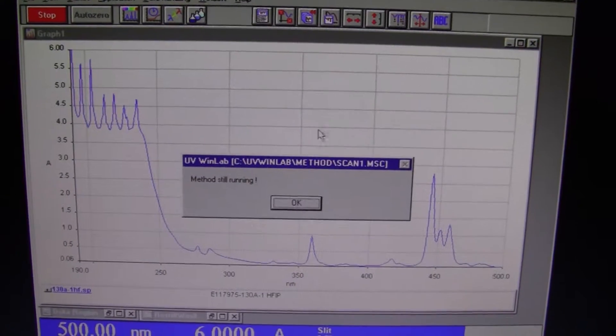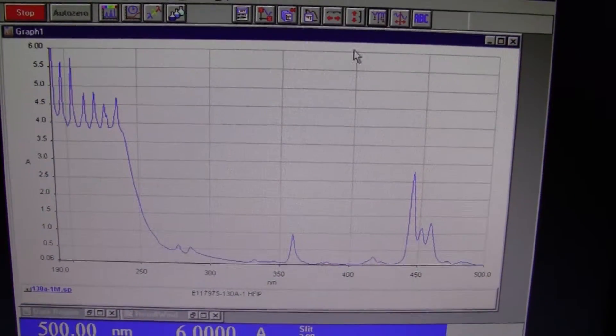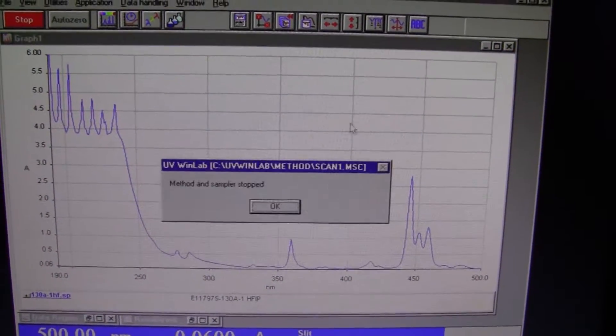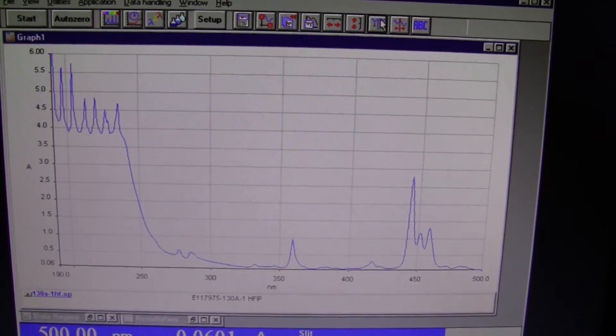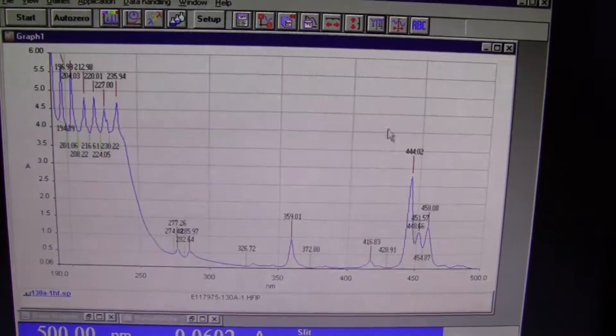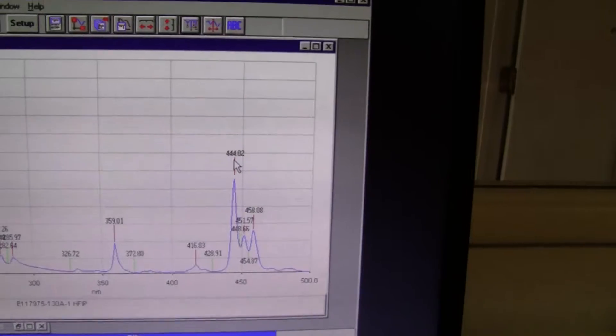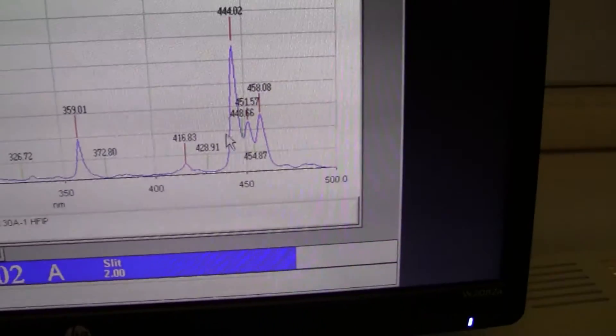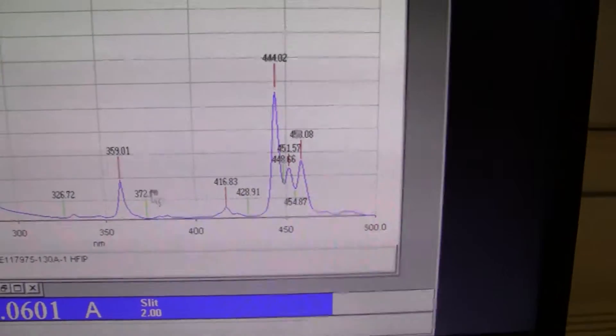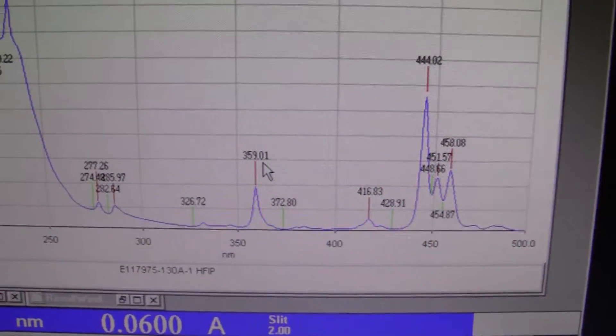Let us generate some data. I hope the method is still running. Generate some data. And we get right up there at the 440 mark, so it does need a little bit of calibration. However, there are your three holmium peaks, mountains, and there's your one at 359.